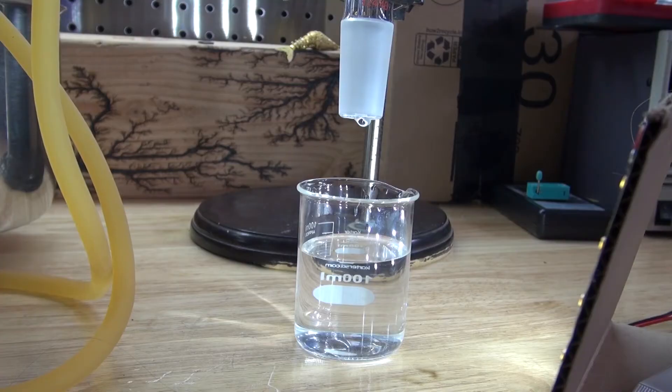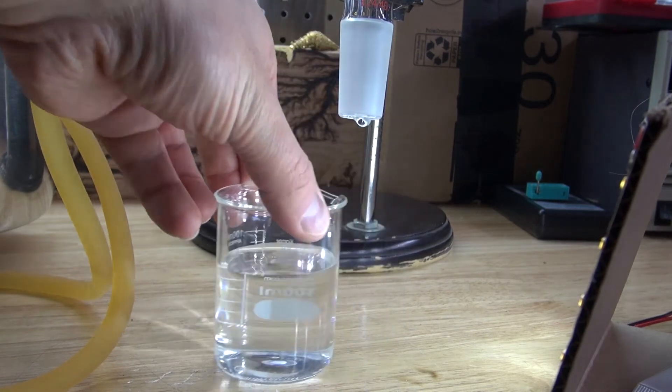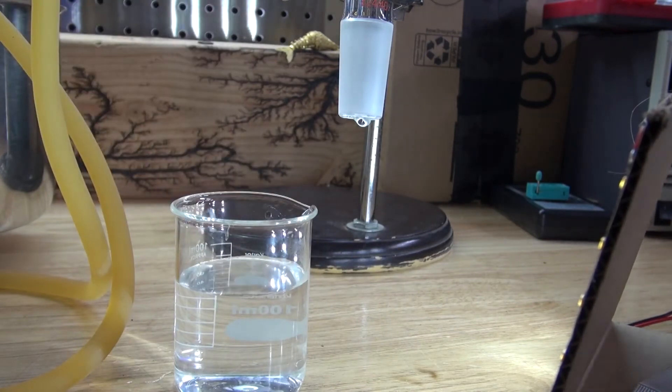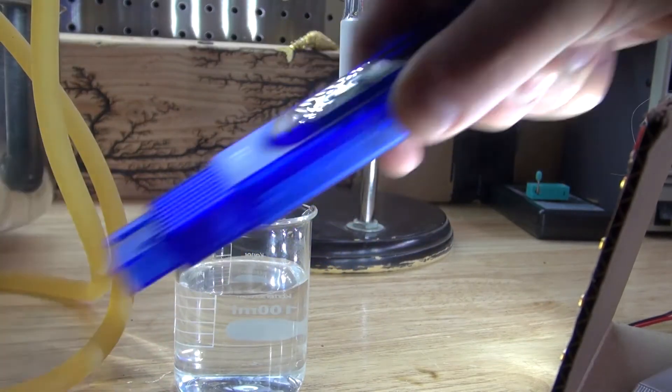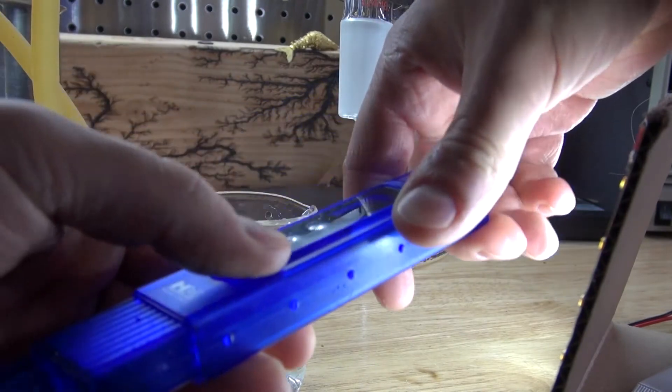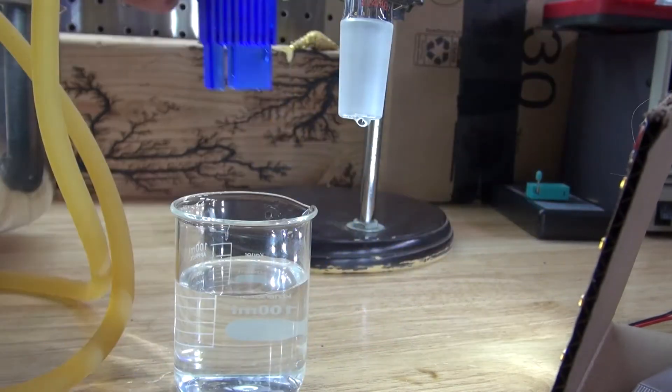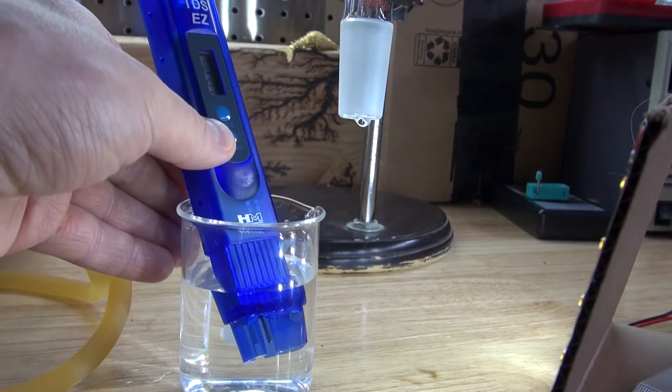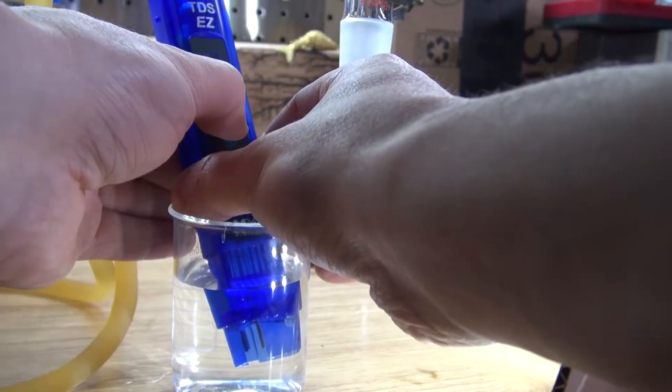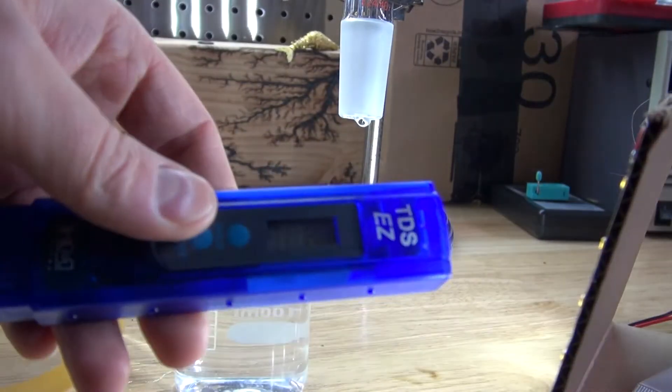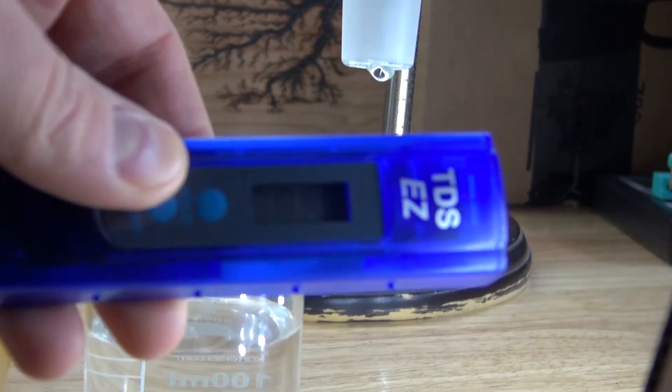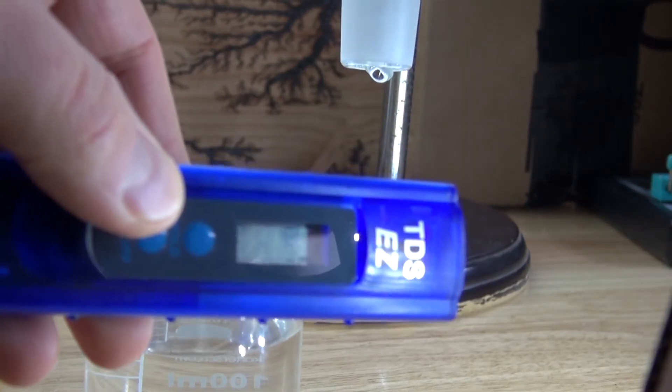30 minutes later my beaker is full and I've distilled all of the water. Now let's test it out and see how many total dissolved solids are in this. Take my TDS meter, turn it on, and let's test the water. And there we have it. It is now 2 parts per million. Big difference compared to 356.